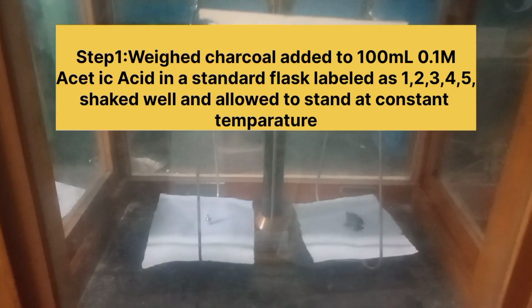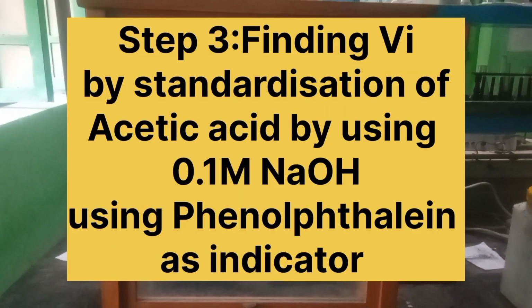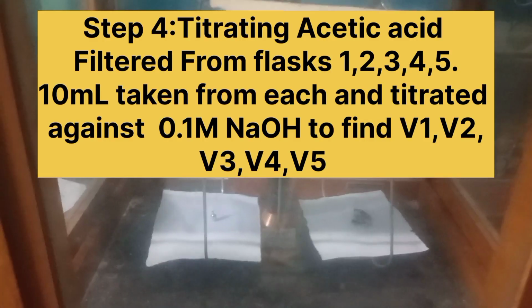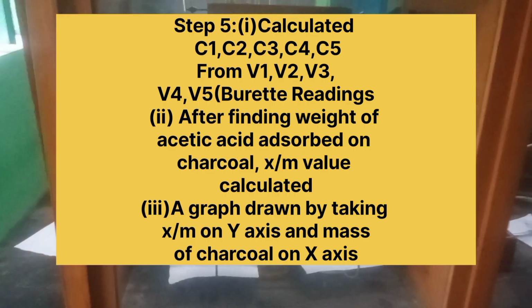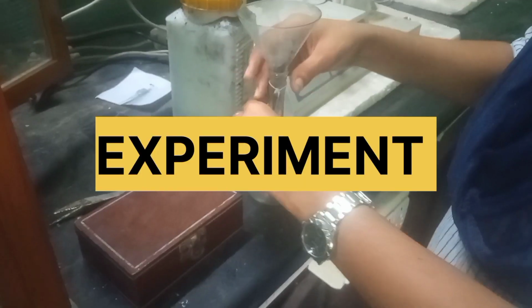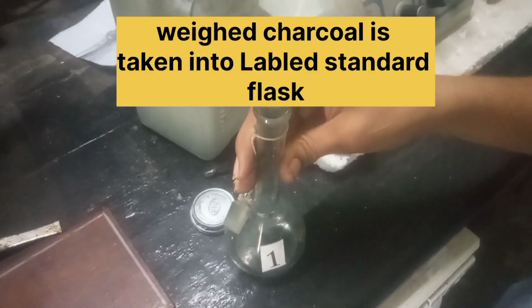In this experiment, charcoal is adsorbent and acetic acid is adsorbate. This experiment is based on standard addition method. To study how the intensity of adsorption changes with the mass of adsorbent, one has to follow the following steps.